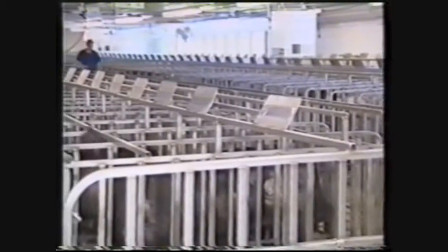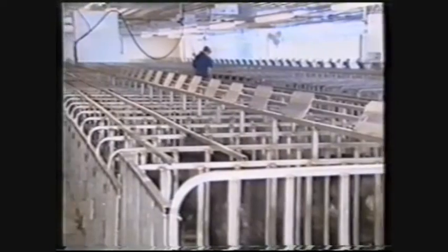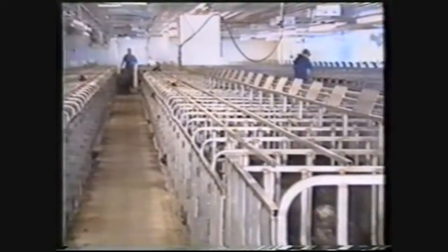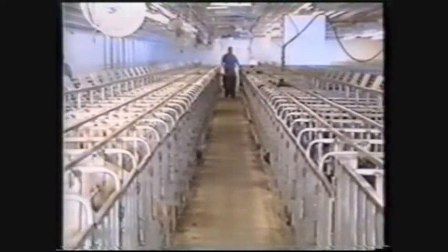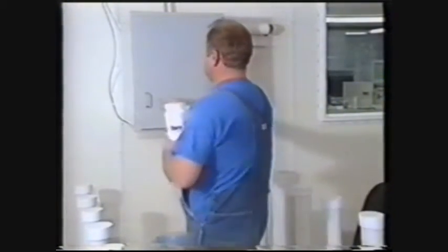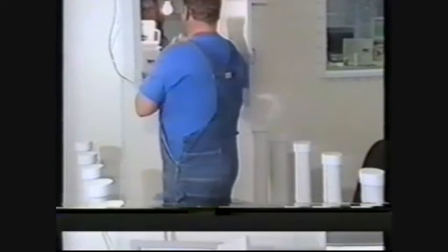Remember that patience is a key to animal husbandry, and if you lose your patience with a young boar, you may never regain his trust. If you or the boar are becoming frustrated, return the boar to his pen, ending the session, and try again another day. Once collected, the semen should be quickly transported to the AI lab for analysis and processing.